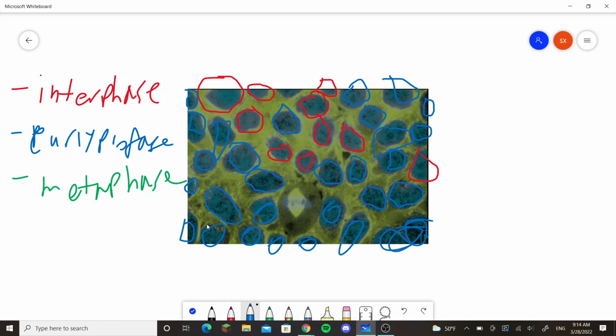Are yours all just early prophase? Yes, except, excellent question, Justin. He's a teaching colleague of mine. This one is in metaphase, and how do we know it's in metaphase and not anaphase? It's because of this line. Exactly. All the chromosomes line up.